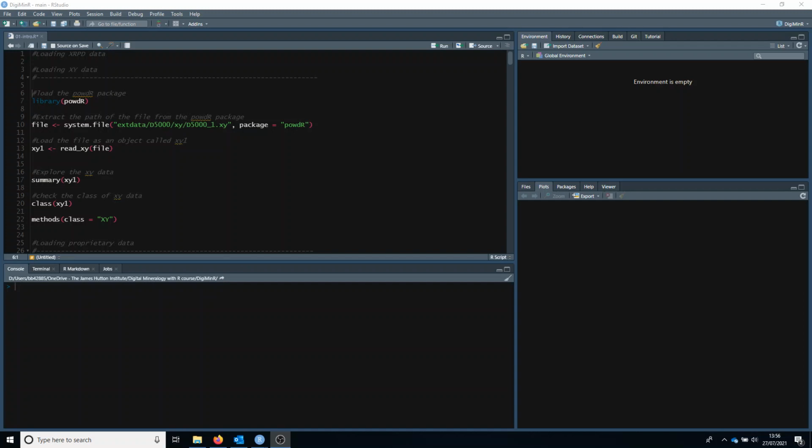What the videos involve is simply going through all of the code that's in the material for the course online, just in video format, and I'll have time to elaborate on a few things to kind of unpick what the code is doing, and hopefully make it a bit easier to understand.